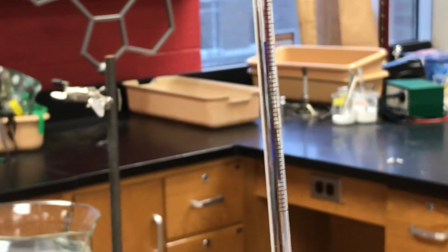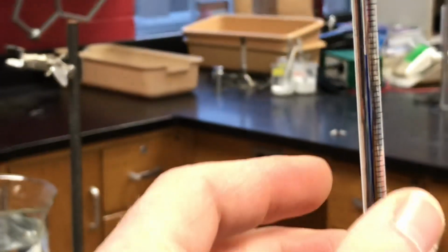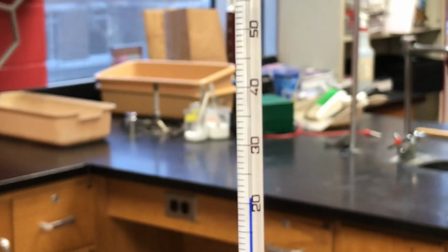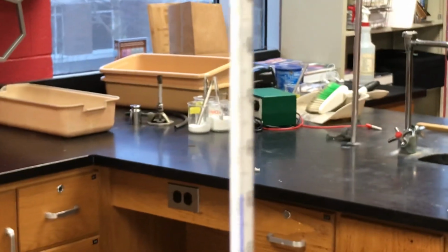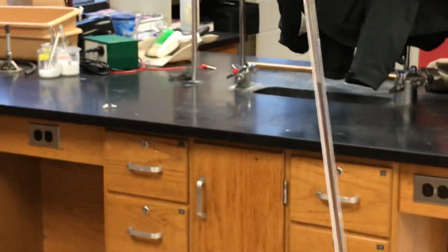It looks like the temperature is just under 21 degrees. Let's call it 20.8 degrees Celsius. I'm just going to turn it a little bit so we can see that. See there, you got 20 and 30. It's between 20 and 30. Very close to 21, but Mr. Helva gives us about 20.8 degrees Celsius, room temperature.